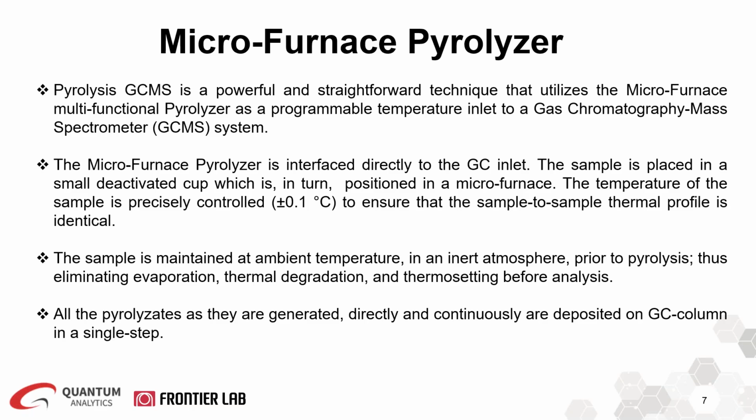Although I want to point out that you could use other detectors depending on your application, for example, FID or NPD. And one of the application notes that I will cover actually shows using pyrolysis GCMS, FID, and NPD as well. So the microfurnace pyrolyzer is directly connected to your GC injection port.